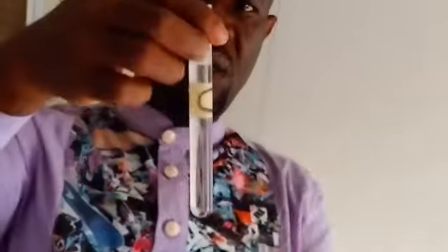So you see that C had dissolved totally, clearly dissolved. Let me shake it a little, then clear every insoluble substance. So C had dissolved clearly to give you a colorless solution. Okay, so let's go to the whiteboard.